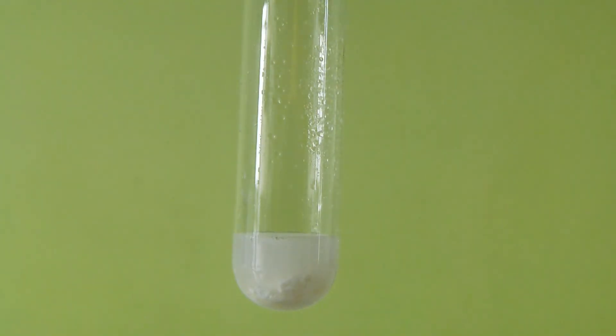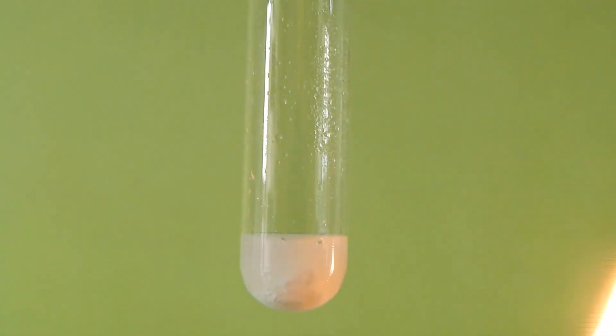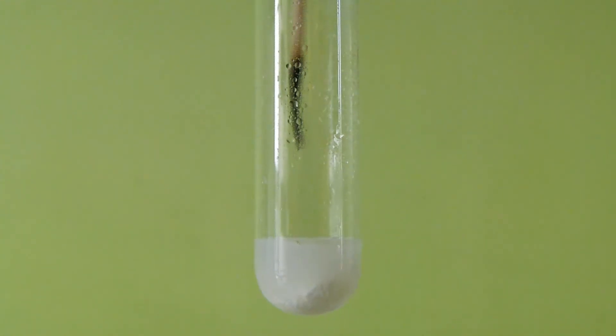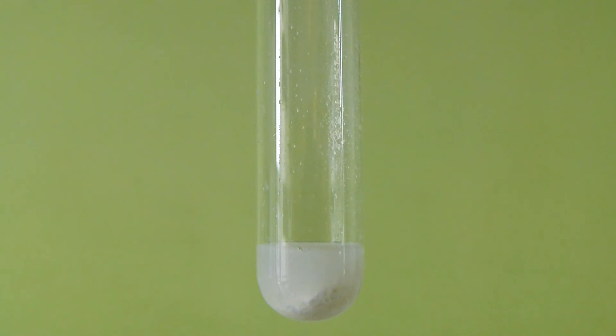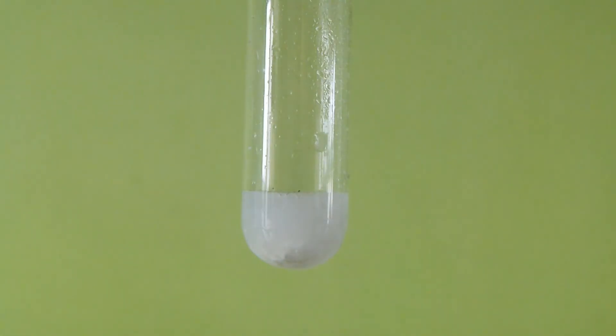To test for the presence of oxygen, I first insert a burning piece of wood, and you can see that it immediately is extinguished, which solidifies my theory of the bubbling being CO2 gas. To release the oxygen from the solution, we need to decompose the peroxide first, and for that I add this black piece of manganese dioxide.